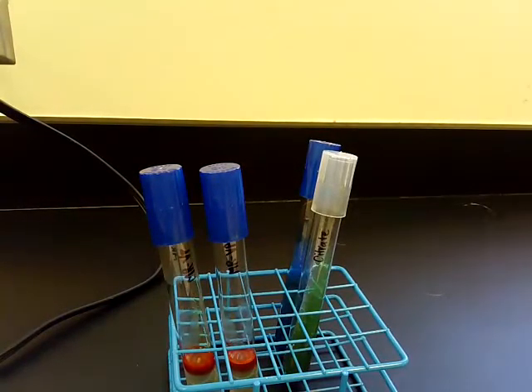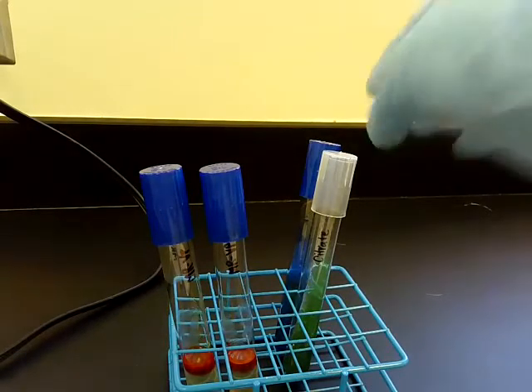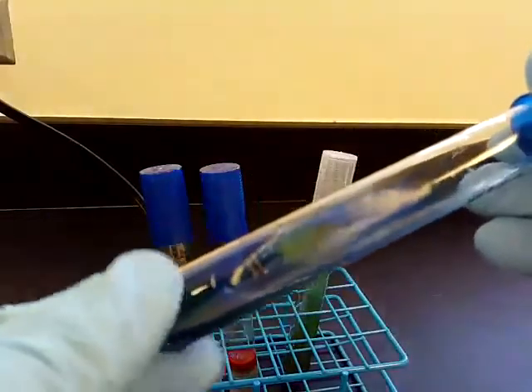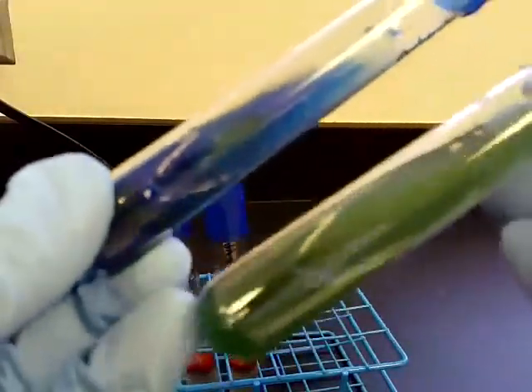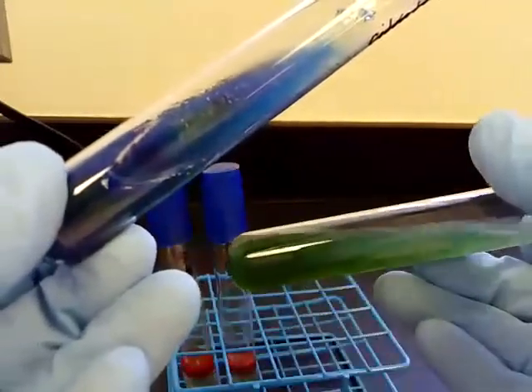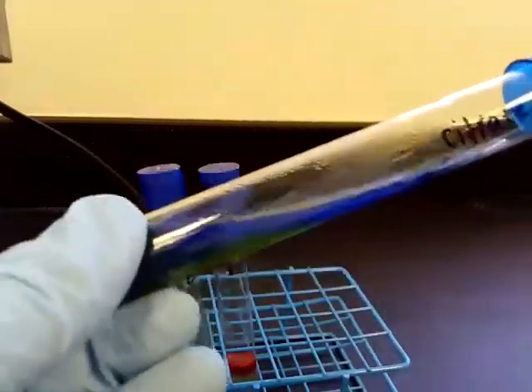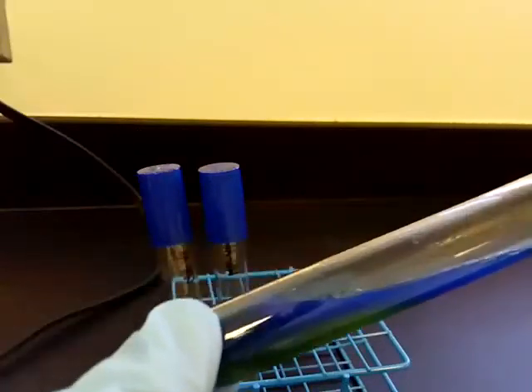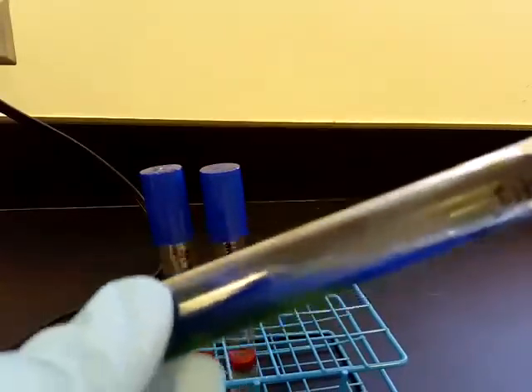The next test was a citrate test. If the microorganism can utilize citrate, it's going to eat up the citrate in the medium, and then it's going to produce ammonia. And if that ammonia is present, that's a base. So you're going to see a color change in the agar. So you can see our tube here is blue in color, and this was the original tube. So when you compare the original, this is a negative result, and when you look at the actual culture tube, this is a positive result. So you can see the blue color change is positive.